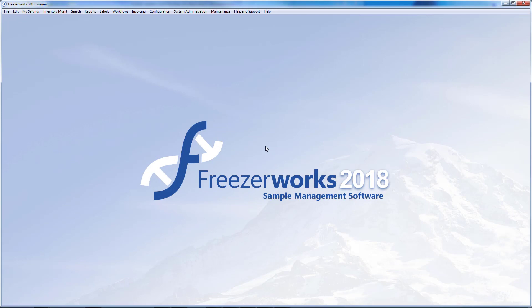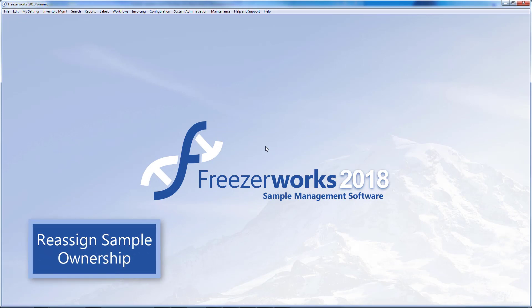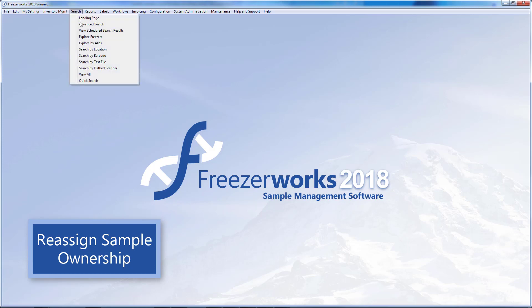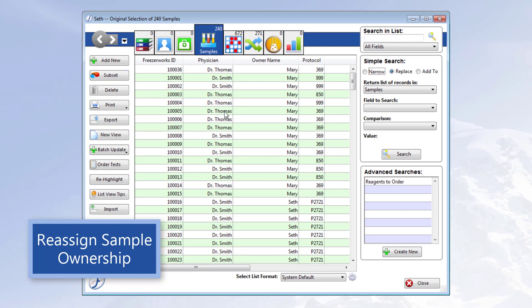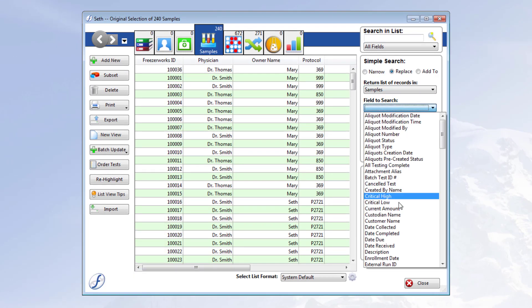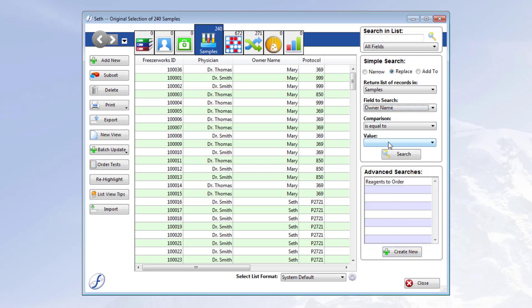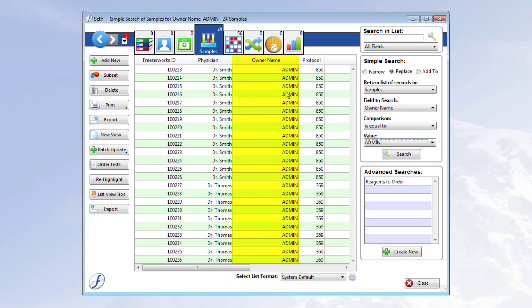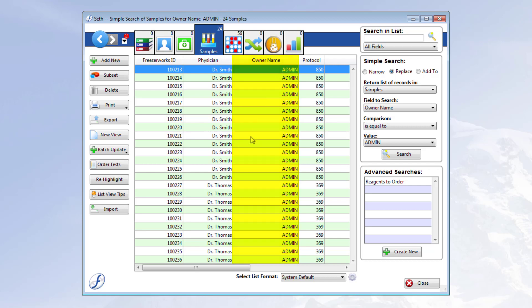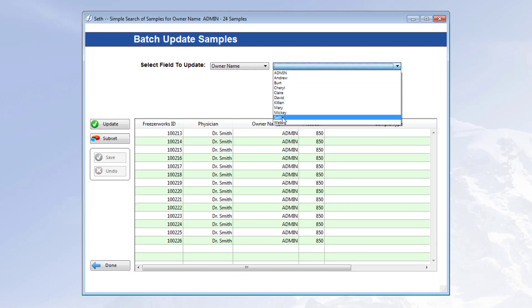Finally, due to this change to sample ownership and the groupless nature of the admin superuser, any samples owned by admin must be reassigned before the upgrade can be completed. Start by searching your database for all samples with the owner name of admin — I'm going to use simple search and just look for where owner name is equal to admin. Then, with the owner name on the list view, begin using batch update to reassign ownership as you see fit. Just ensure that the new owners are not members of multiple groups, so that no new conflicts arise.